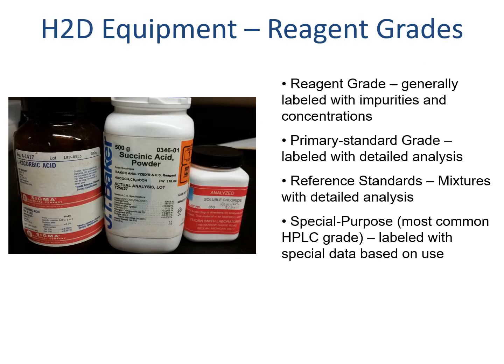A few more notes on tools of the lab. Not all reagents are the same quality. Reagent grade materials are relatively standard. They're controlled to a given purity and are used for reactions and making solutions. Some reagents are used to calibrate other reagents, though. Those are known as primary standards. These need to be controlled very carefully to ensure that they remain pure and are dry when measured, which in turn allows for accurate measurements of other solutions.